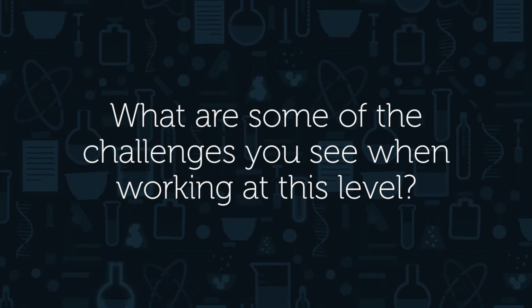So I think one big challenge for droplet microfluidics is robustness. I was saying we can do many things better than microtiter plates, but there are also a couple of disadvantages, such as that droplets in theory can fuse, which you don't want. Another thing is people develop many different modules for droplet microfluidics, but they are maybe not perfectly compatible with one another. So I think the big challenge is to integrate different modules into one single platform and to increase robustness.